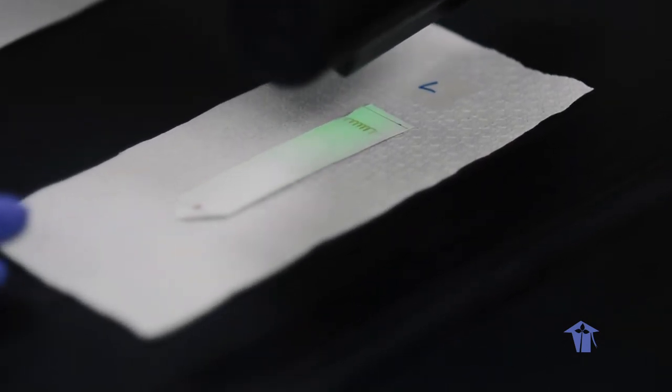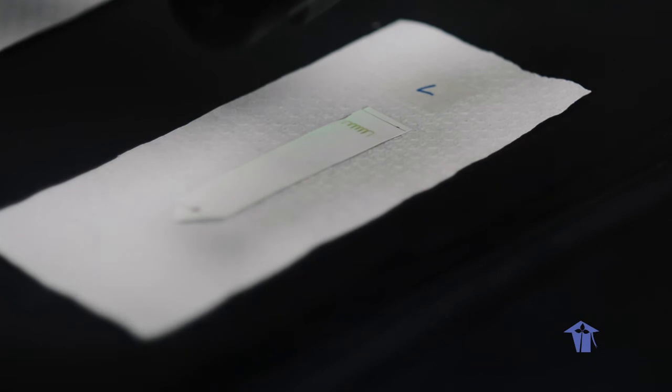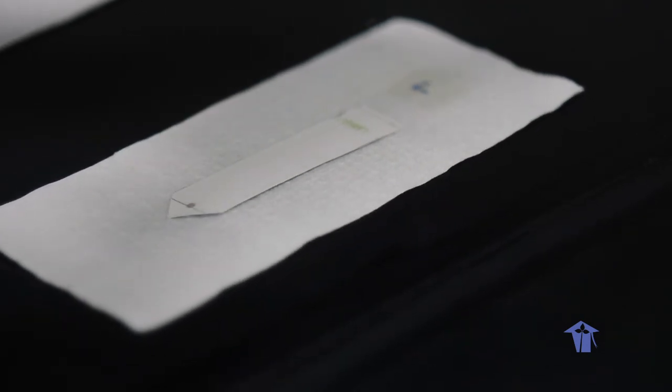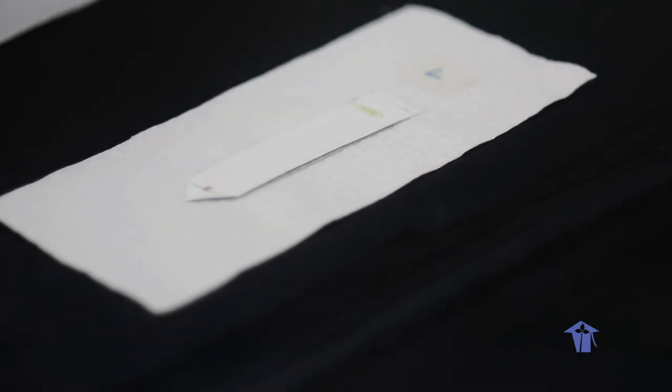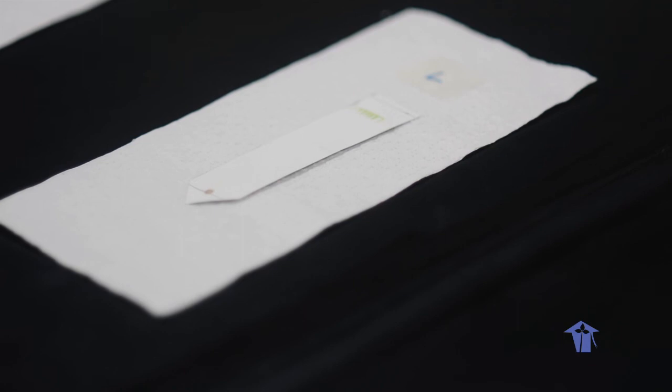And these are the results of our investigation today. When we meet in our virtual classroom, we are going to discuss how we will interpret these results and calculate the RF values in each of the different samples of chromatography.